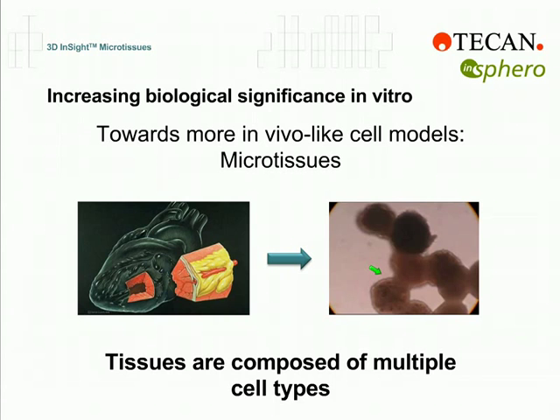cardiomyocyte in vitro. However, a tissue is not only composed of a single cell type, which would make things on an analytical basis a bit easier. Tissues are composed of multiple cell types. And if you would like to discriminate effects on different cell populations within a tissue model system, we need quite specialized technologies to get the discrimination.